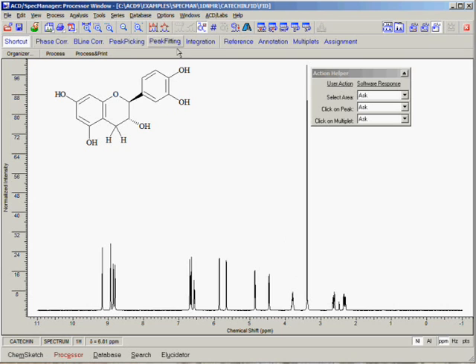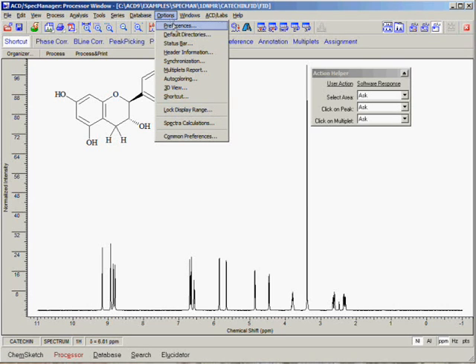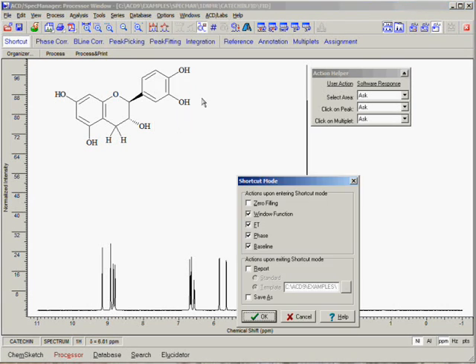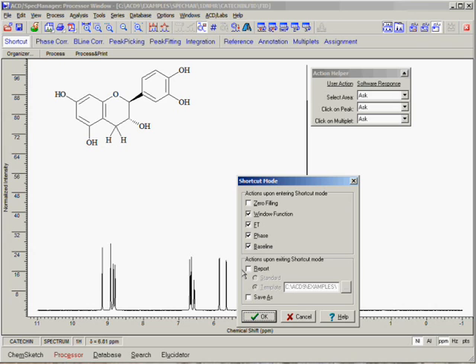Please note that we can choose which steps to automate by going to the Options menu and selecting Shortcut. In this dialog box, we can see all of the processing steps that can be performed automatically when entering Shortcut Mode. Also note that we can choose to execute specific actions when exiting Shortcut Mode, such as Automated Reporting and File Saving.